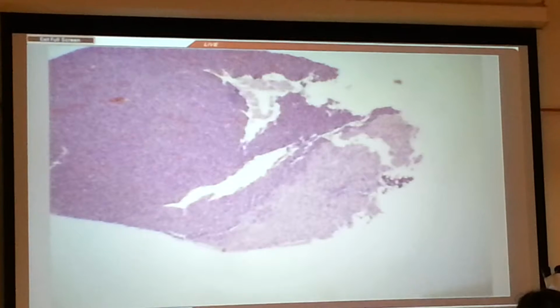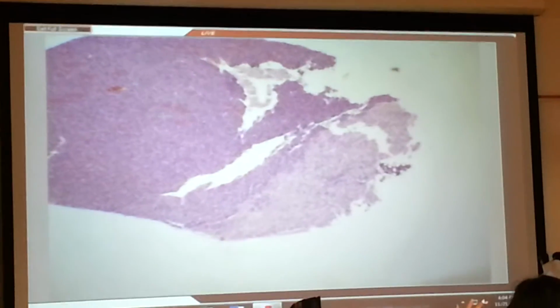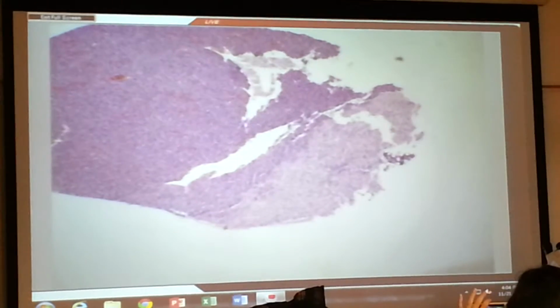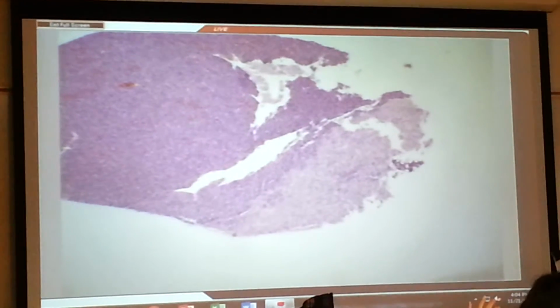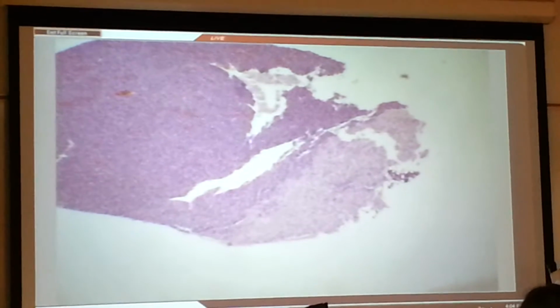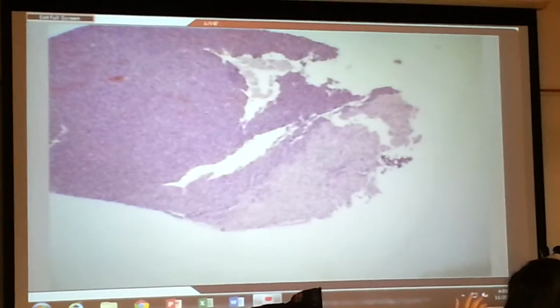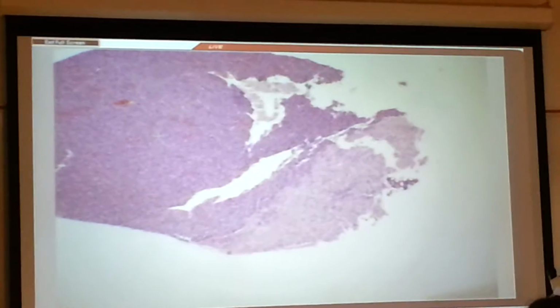The dark part is the anterior pituitary. The anterior lobe is the dark portion. The lighter color here is the posterior lobe of the pituitary gland. We'll talk about this in lecture. You don't really care today, but the anterior lobe is a much more traditional gland. It looks like most of the rest of them, lots of dark purple cells. Posterior pituitary is really different. It's mostly neuron, actually mostly axons, which is why it's so white, because there's all that fat. So anyway, the dark-light split: the light side is posterior pituitary, the dark side is anterior pituitary.